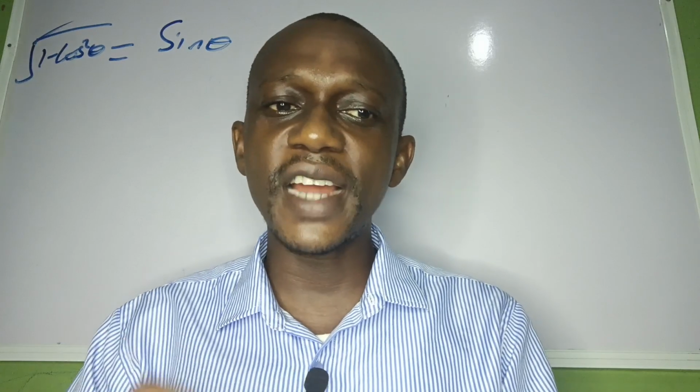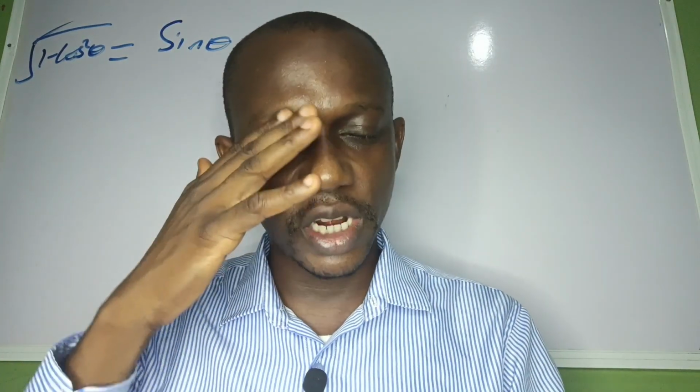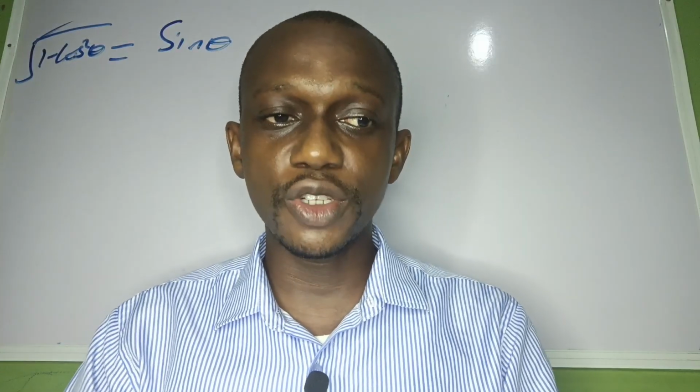Initial and final reading. If the initial and final reading are interchanged, now you are supposed to have initial reading down, final reading up. So if you interchange it with each other, okay, that's -2.